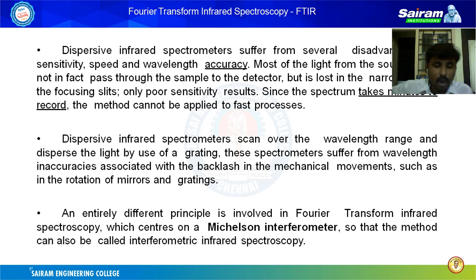It has become a common feature in modern spectroscopy laboratories. A wide range of commercial FTIR spectrometers with very different specifications are now available. This has become possible with the availability of inexpensive microcomputers. The Fourier transform technique depends upon the basic principle that any wave function can be represented as a series of sine and cosine functions with different frequencies.